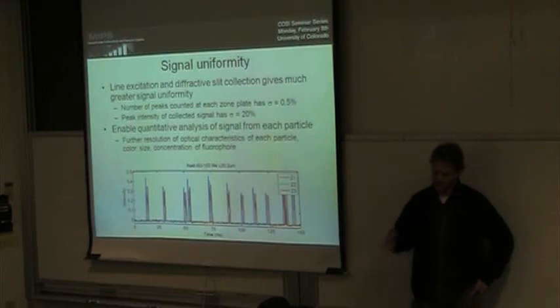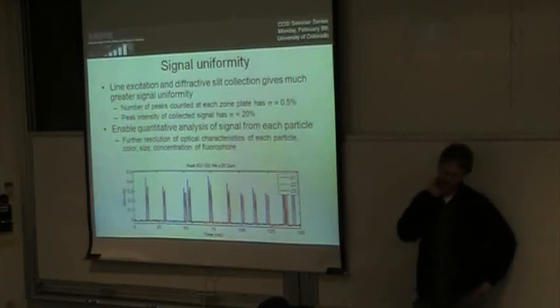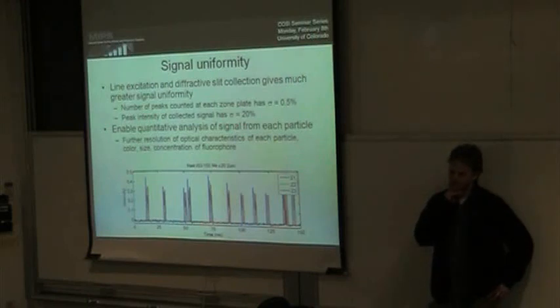And they do the same thing. It's fluorescent activated cell sorting. They call it FACS sometimes. You look for a fluorescent signal, it flashes, and then you turn on your electrodes. That would be hard to parallelize with 64 channels, I think, but this system can support that potentially.